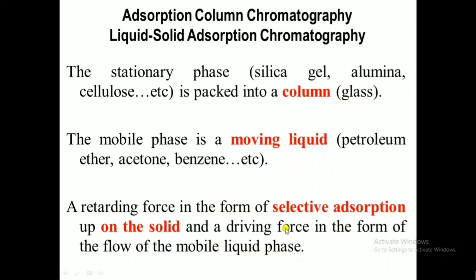Next, what is the principle behind the separation, or the retarding force felt by the components when they are moving through the stationary phase? The retarding force is in the form of selective adsorption. It's very important: selective adsorption. You know what adsorption is.